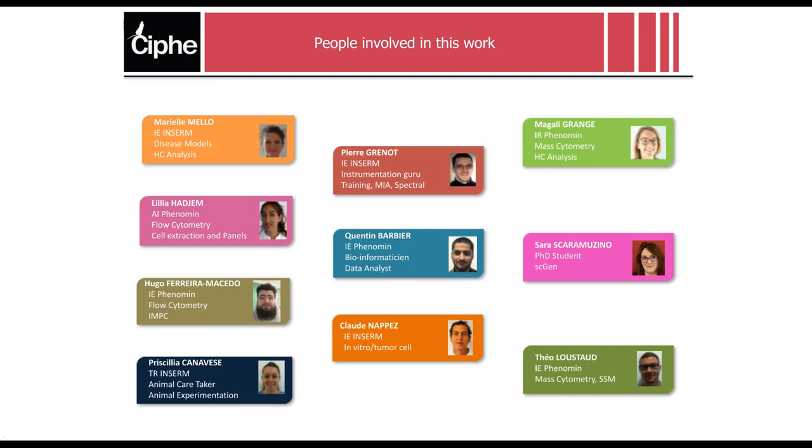I have to say now we are not restricted, because we actually do a lot of flow experiments, loading them on Cytobank, also spectral, and we also did some multi-omics datasets where we look at protein and gene at the same time. There are some restrictions. It's limited to 800 variables, but this is nice because it allows biologists to be at the heart of the action and drive their own analysis.